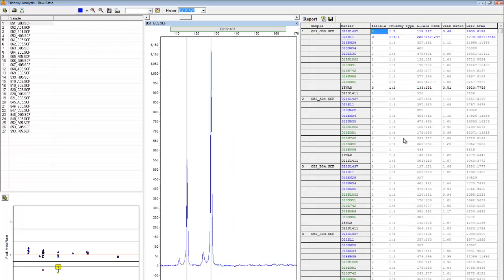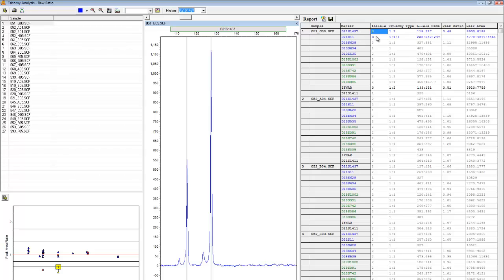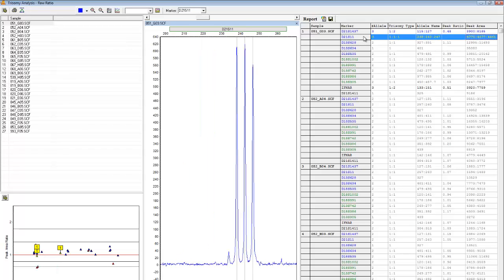Markers in the trisomic range are most efficiently identified using the report table. The first two columns of the report table show the number of alleles at a given marker, and the trisomy type. Click on a marker to be taken to its specific electropherogram. For example, if I click D21S11, I can visually confirm that there are three alleles present, and that they have a one-to-one-to-one trisomy pattern.